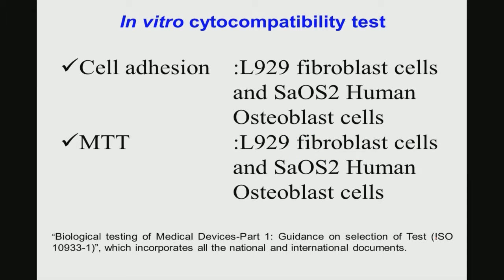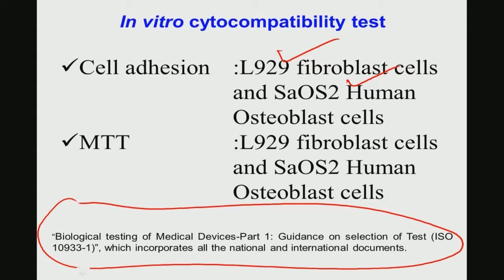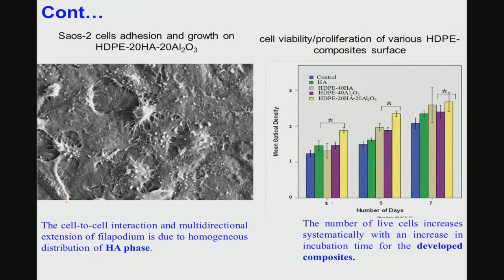Some of the in vitro results. We have used both L929 mouse fibroblast and osteosarcoma cell lines. We have done MTT, and then we have followed ISO 10993-5, which is the typical guideline. So, this is the scanning electron microscopy image of the osteosarcoma cells, which shows the typical flat morphology that osteoblast-like cells exhibit.